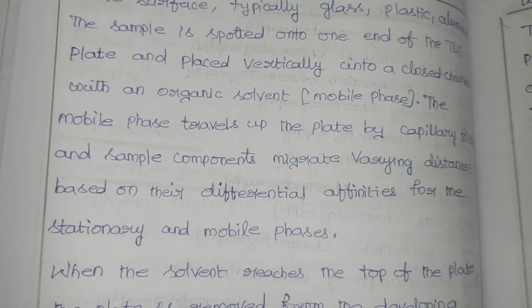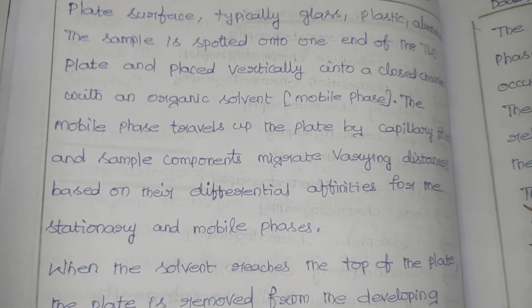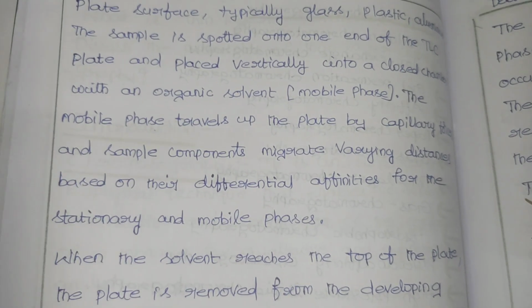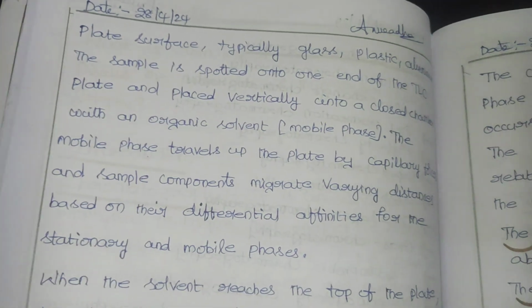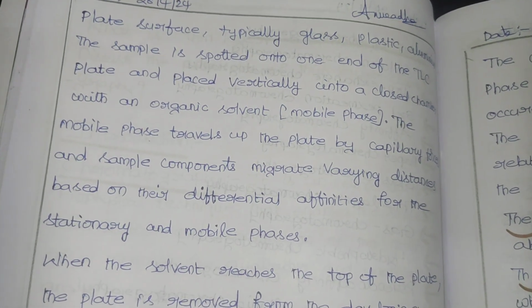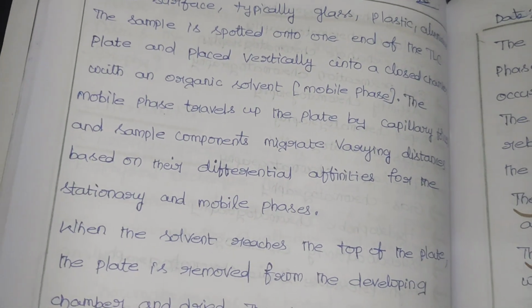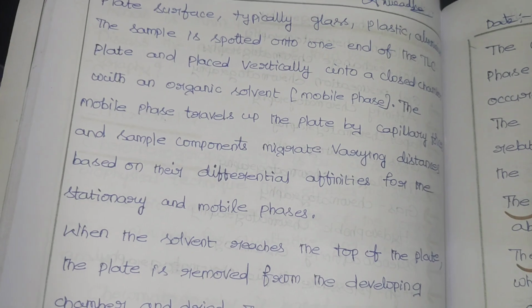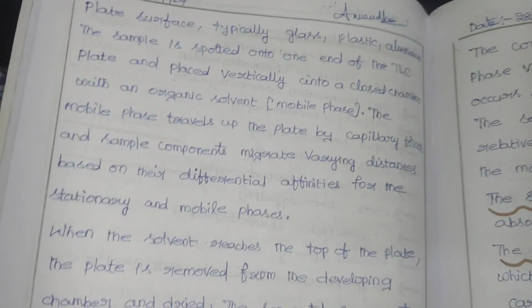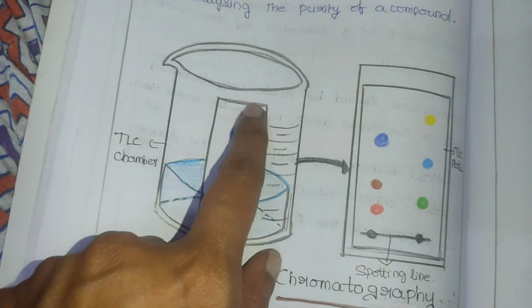Then the sample is spotted onto one end of the TLC plate. So first we take the thin layer chromatography plate and spot the sample on one end, and place it vertically in a closed chamber with an organic solvent. So we have to keep an organic solvent. The mobile phase travels up the plate by capillary forces.